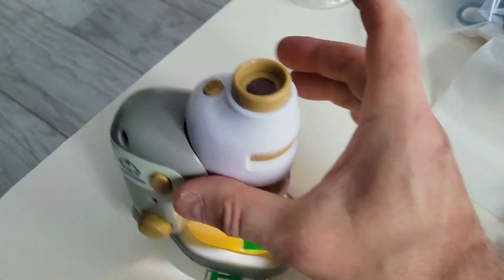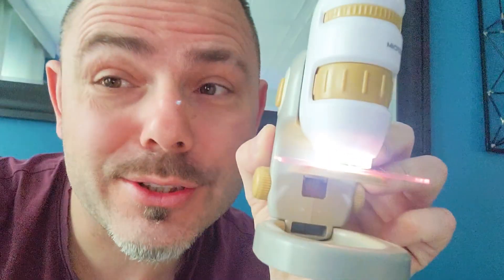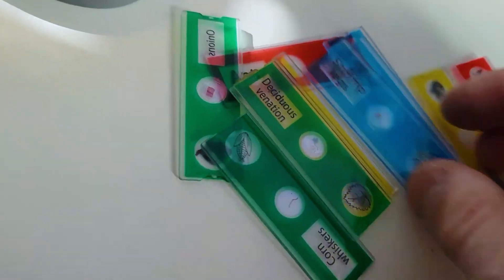If you're looking to introduce your kids into science, you may want to consider getting a little tiny kid's microscope. It's 60 to 180 zoom. We're going to show you exactly what it comes with and how to operate it.